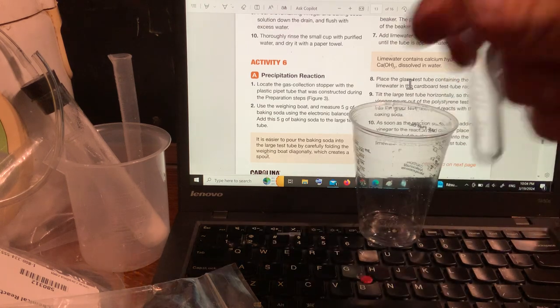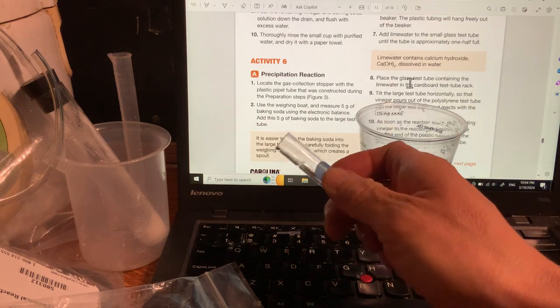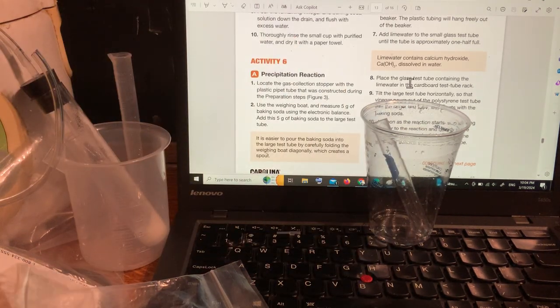Okay, I have my clean glass. This is the glass one. It's blue label, right? This is the glass test tube, small glass test tube. There is a bottle of lime water here. Let me find it for you. Is this it? No, this is not it. This is phenolphthalein. Okay, it's not.